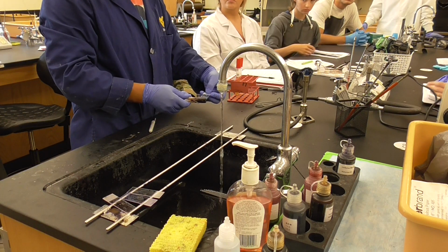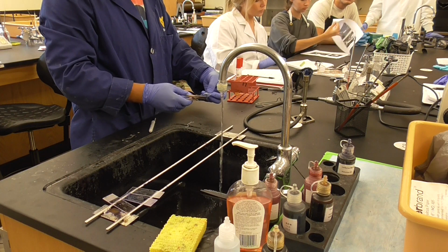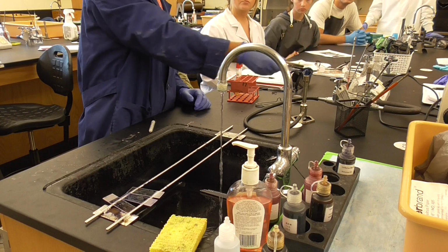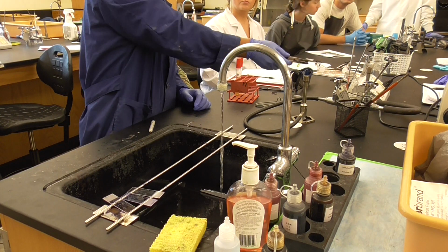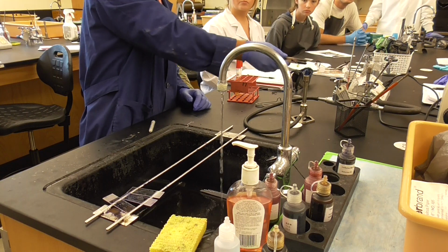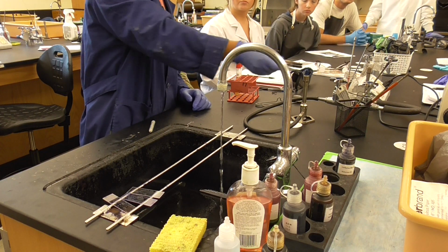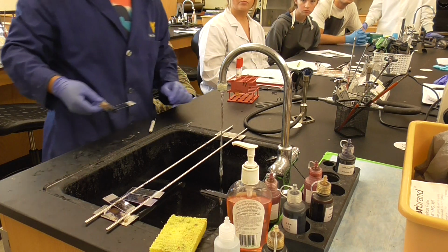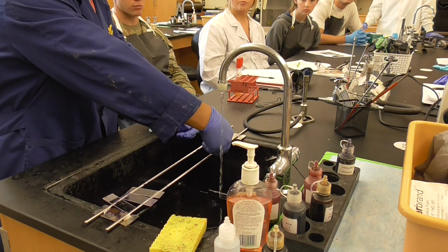What are you gonna do? The heat fixing. Back and forth like this, a couple of times. Okay. Not cooking. Not like talk to your friends or something. Make sure it is dried. Don't burn yourself. Okay? Okay, now we're gonna put here.